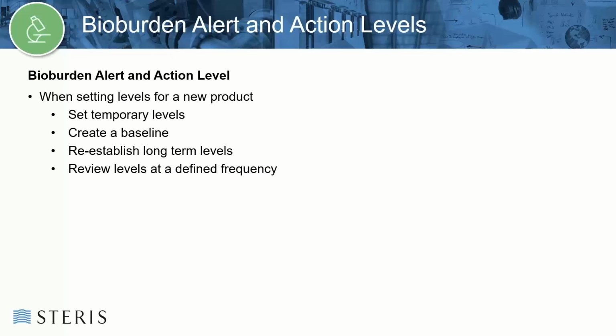Reestablish long-term levels once sufficient data has been gathered. Review levels at a defined frequency to ensure that they have continued appropriateness.